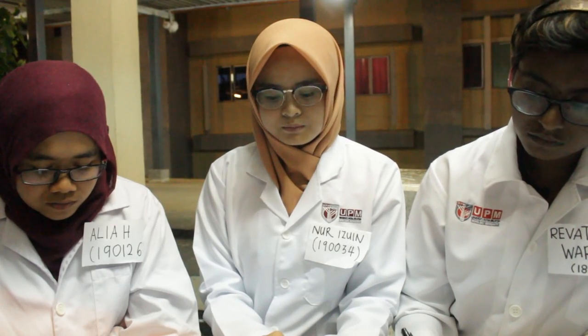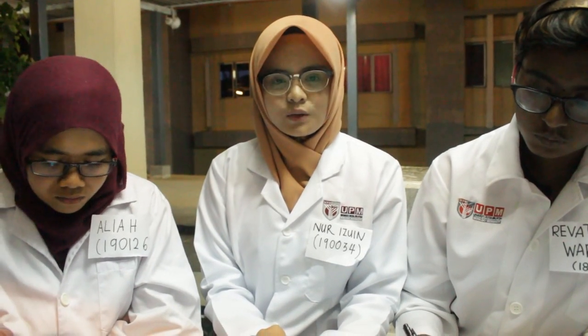Great. Okay, now I will explain about the components of the spectrophotometer. A spectrophotometer has 4 components, which are the light source, spectroscope, sample cell, and detector. For the light source, it has 2 kinds of lamps, which are tungsten and deuterium. For tungsten, its measurement is in the visible and near infrared range, between 340 to 1100 nanometers. For deuterium, its measurement is in the ultraviolet range, with a wavelength range between 185 to 360 nanometers.